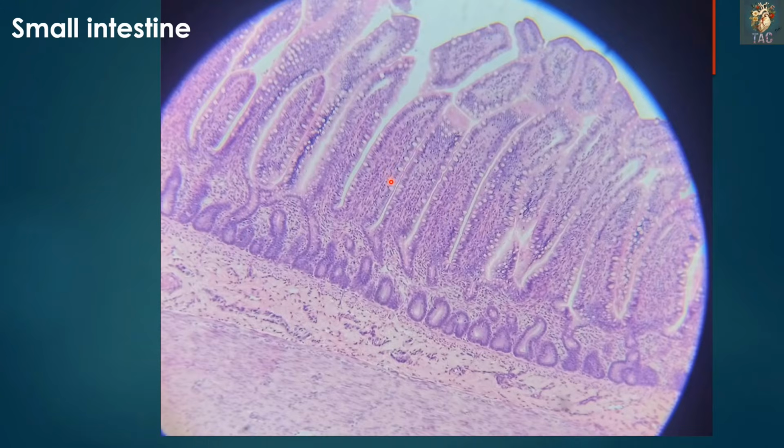Another very beautiful slide of the small intestine taken at higher magnification. Here you can see the epithelium forming the villi, and you can also appreciate that this epithelium is simple columnar with a large number of goblet cells which are present. Beneath the epithelium you can see the glands which are present. Then this is the muscularis mucosae, and then this is the submucosa, and then you can see the muscularis externa which is present. So again, when you are looking at this type of slide, you are simply supposed to write it as a small intestine.